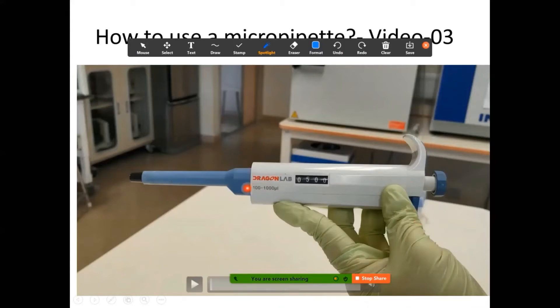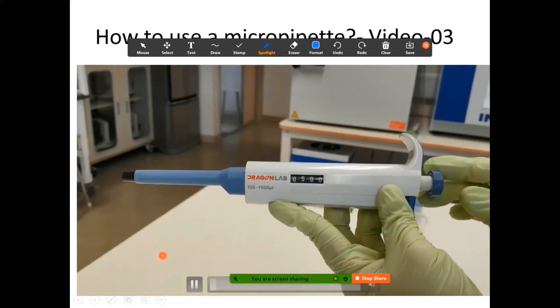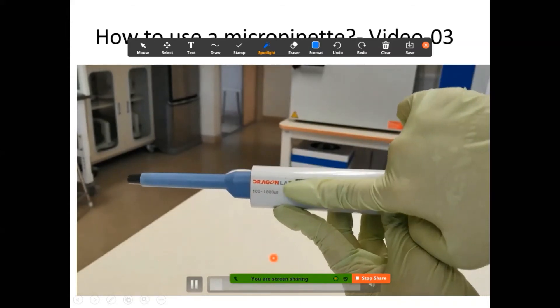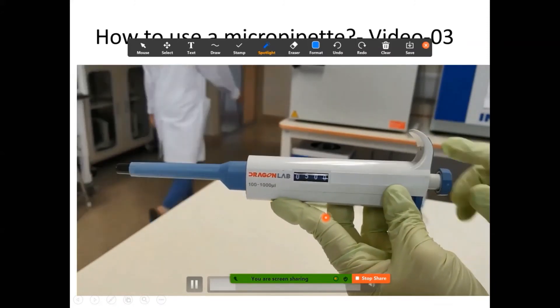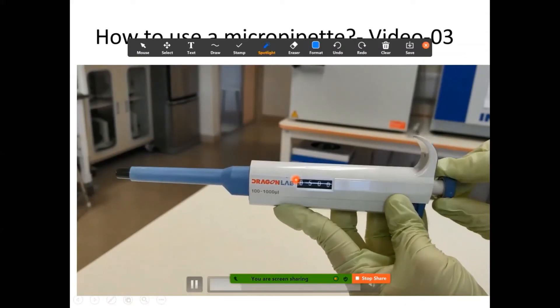This micropipette can read from 100 microlitres (0.1 ml) to 1000 microlitres (1 ml or 1 cm³) — that is the volume range it can extract. There's also a hook where you can safely wrap it around the base of your index finger. Currently it's set to 500, meaning it will extract 0.5 ml of fluid. You can turn the knob to change the volume you extract.